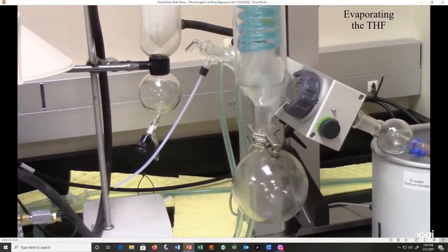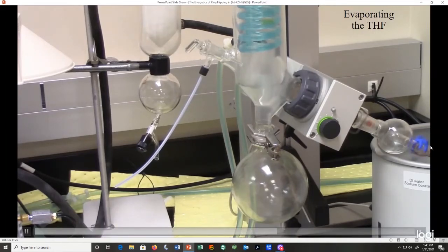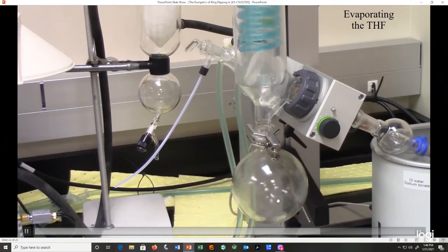We don't want to do this too fast, or we'll create a situation where we'll actually get the fluid to come up here into this bump trap. We want it to be just enough to where we're getting a good flow, kind of a slower flow of THF. And you can see now that we're getting some drips, and we're getting the THF to collect in the flask down here.